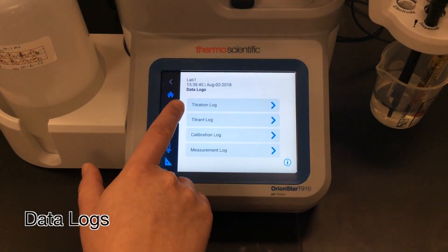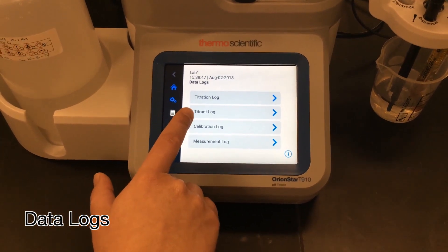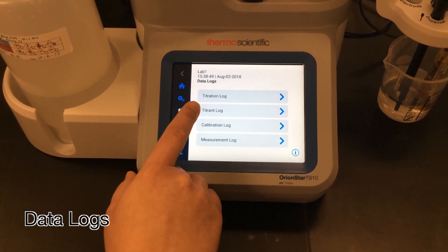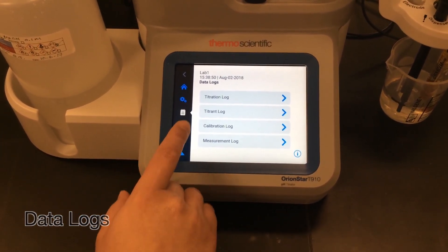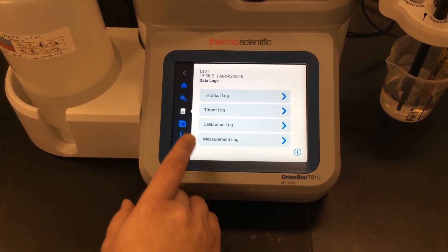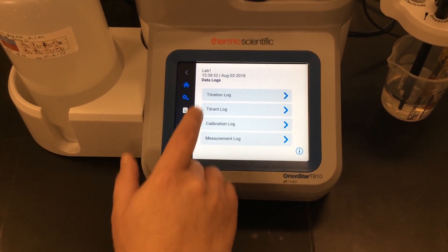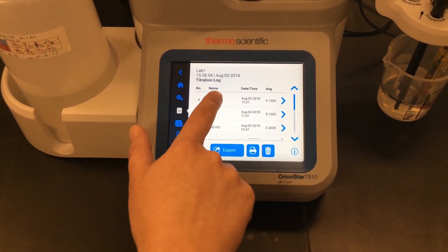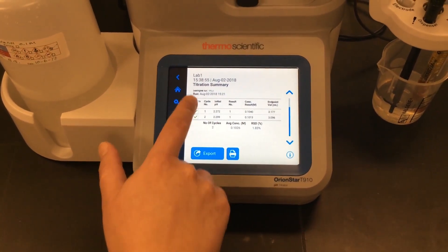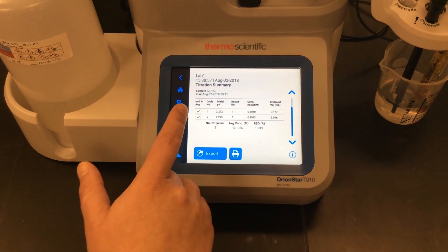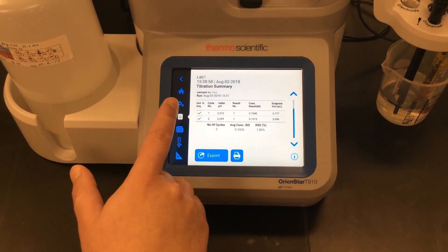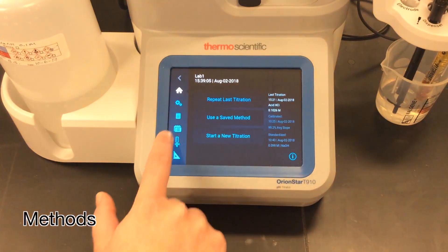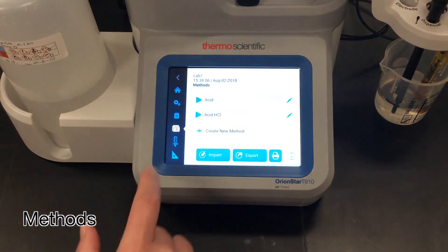From the data log I can see my titration, titrant standardization, calibration, and direct measurements. I'm going to go into my titration and take a look at my data — it will save up to the last 100 data sets.